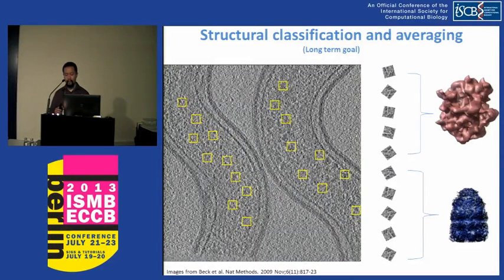And then such subtomograms can be clustered, and the subtomograms of each cluster can then be averaged to obtain a representation of the underlying macromolecular complex structure with increased resolution and improved signal-to-noise ratio. And at the same time, we may also obtain the localization information of these underlying macromolecular complexes.